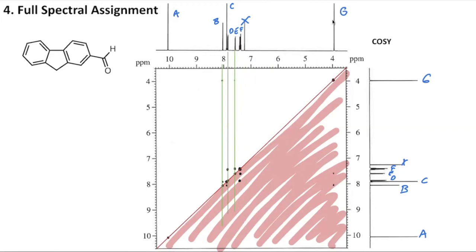Let's go ahead and draw some horizontal lines so that we can see over to the side, and then we can label in those correlations and start to think about them a little later on. So drawing another line here, try to get that as straight as possible, and then we'll move it along. And it looks like we have a couple of peaks here that are correlating back to this side to G. So we'll leave that line there.